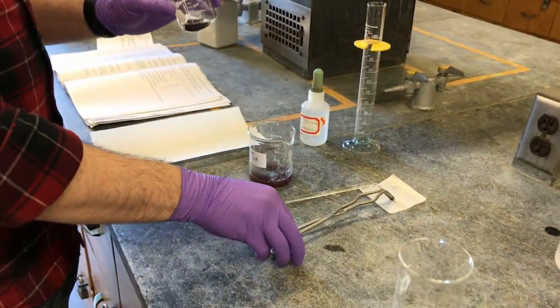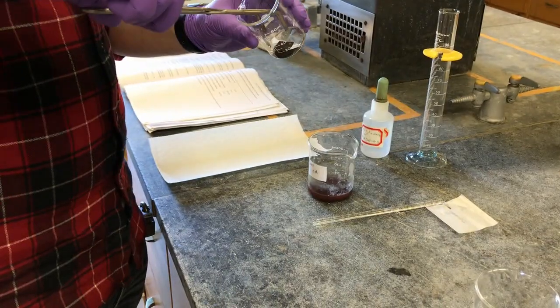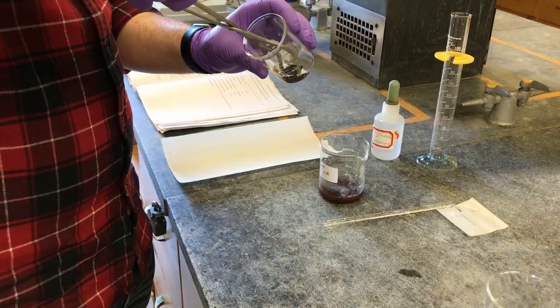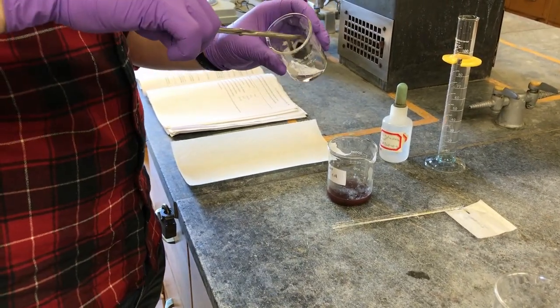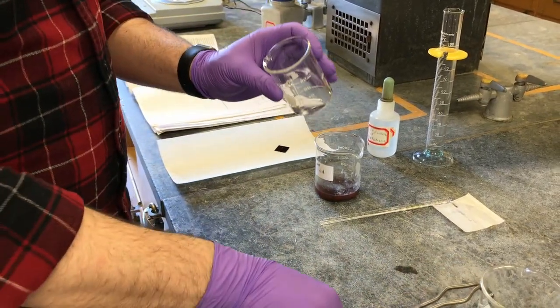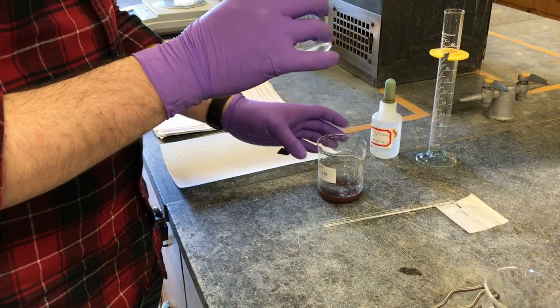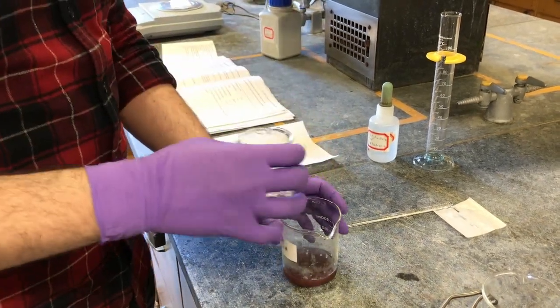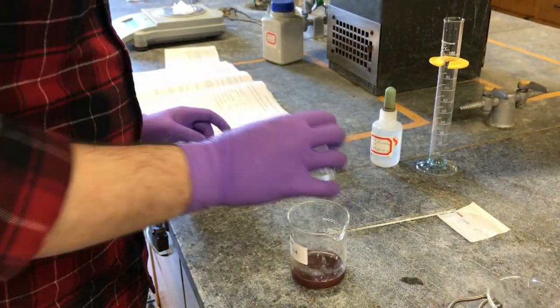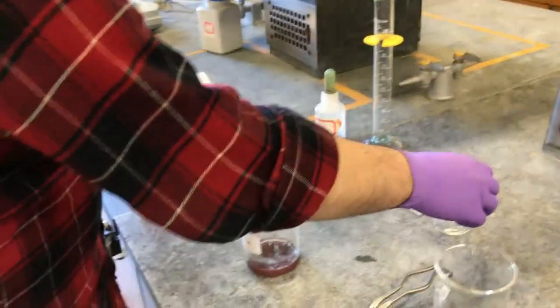I'm then going to remove this zinc piece, and we're going to dry it and then subsequently weigh it. Now with this excess copper that's in here, we're going to swirl it and dump it right back in there. And it looks like no copper's in here.